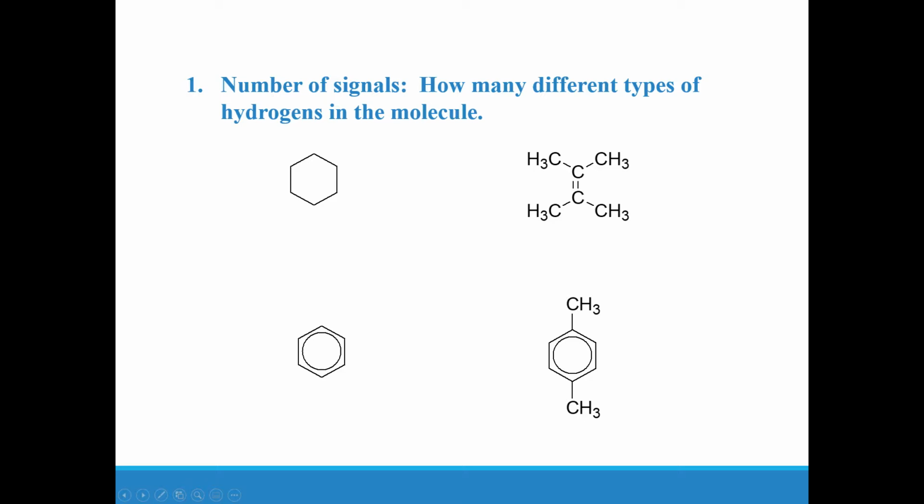Moving on to this molecule, we can see that every hydrogen is blocked off on its own with no neighboring hydrogens. So every hydrogen here should be exactly the same type. Here we have a benzene ring. It's the same as cyclohexane, but instead of 2 hydrogens coming off every carbon, it's only 1.